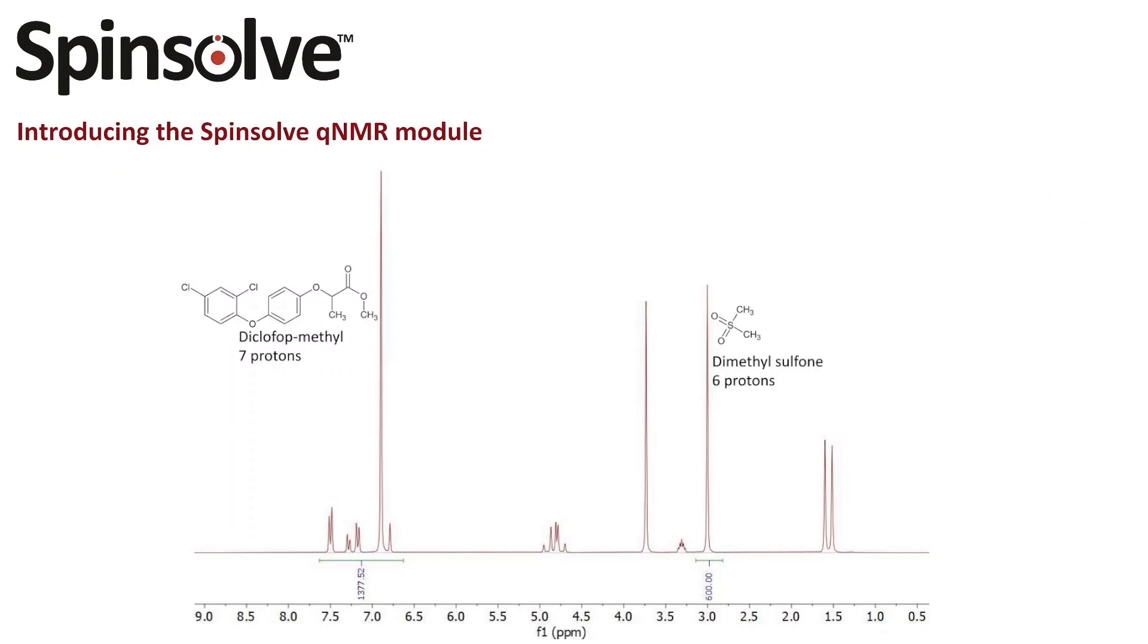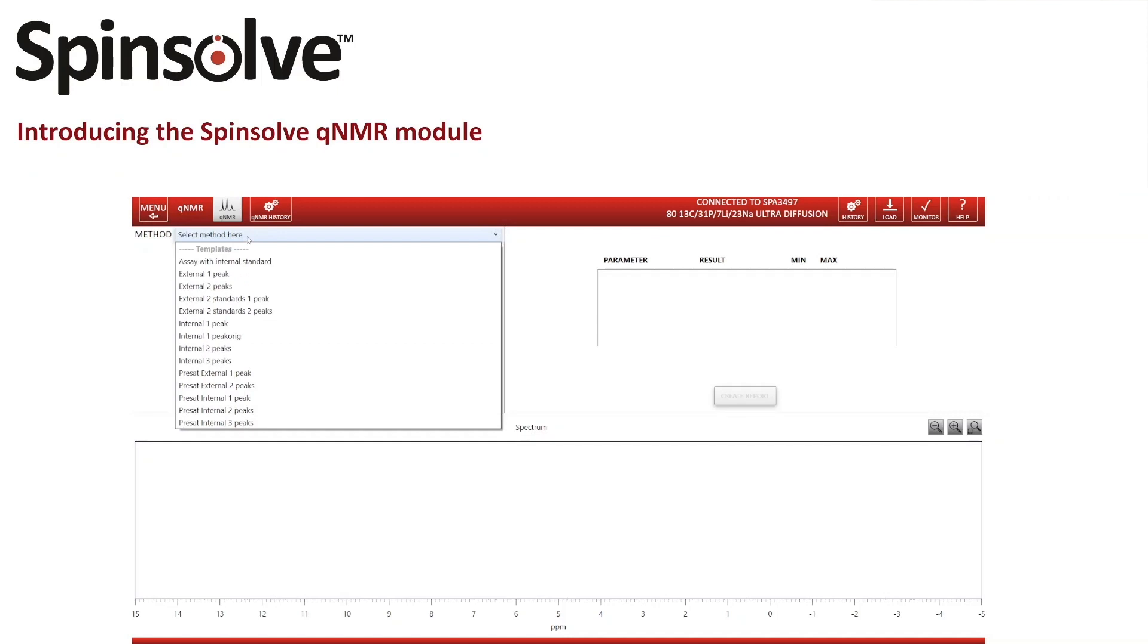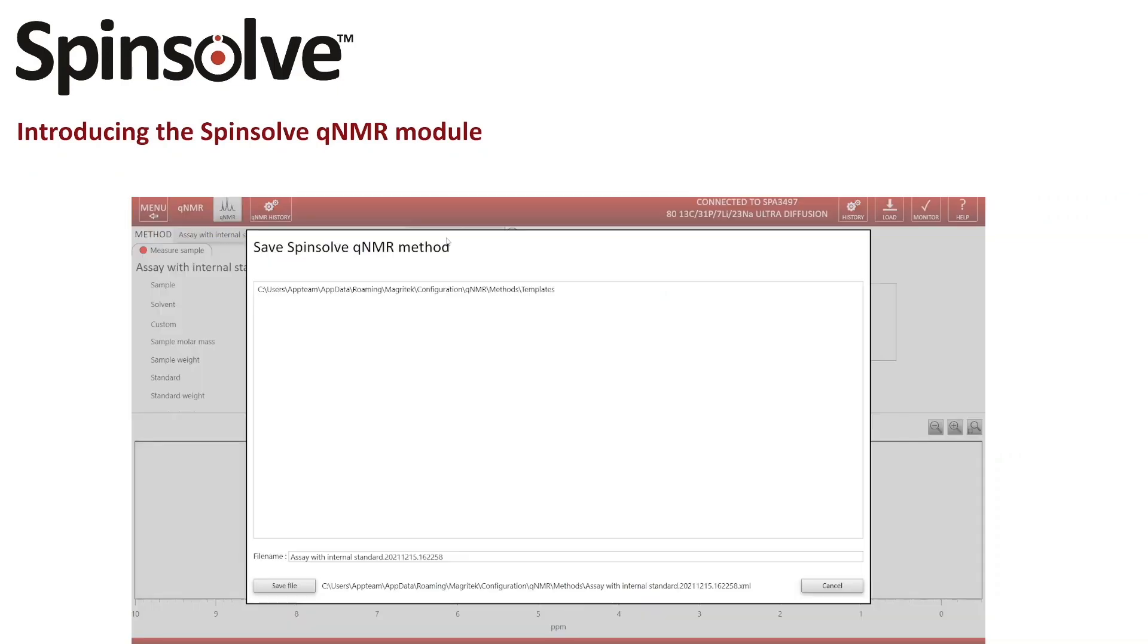To show you how easy it is to set up a new QNMR method, I'm starting from a blank template for QNMR with internal standard. In the QNMR module under method selection I select the appropriate template. First I'm saving the blank method with a new name for the molecule I want to analyze.